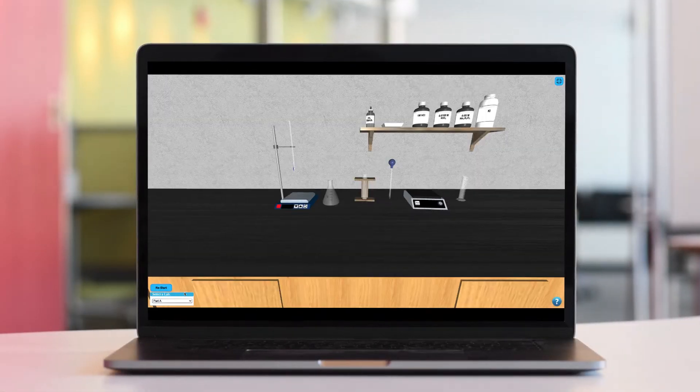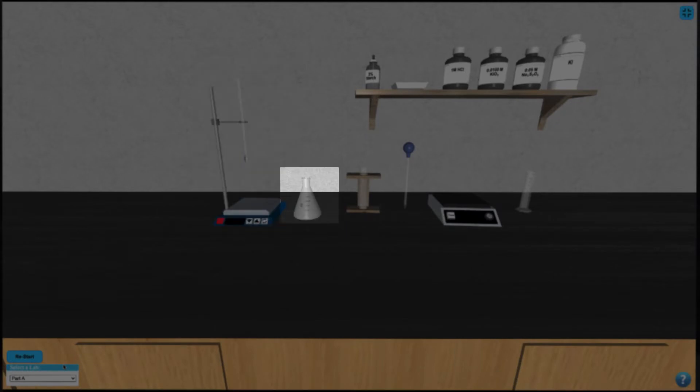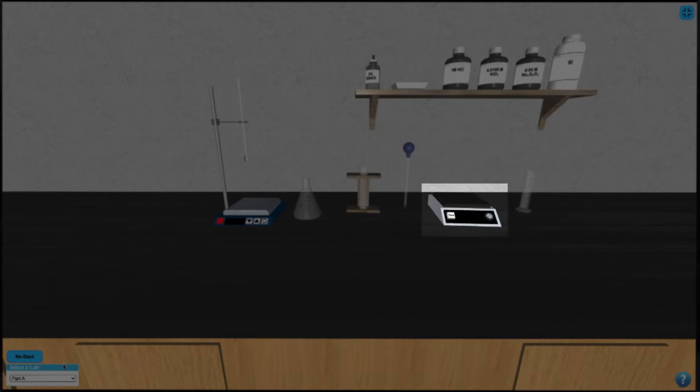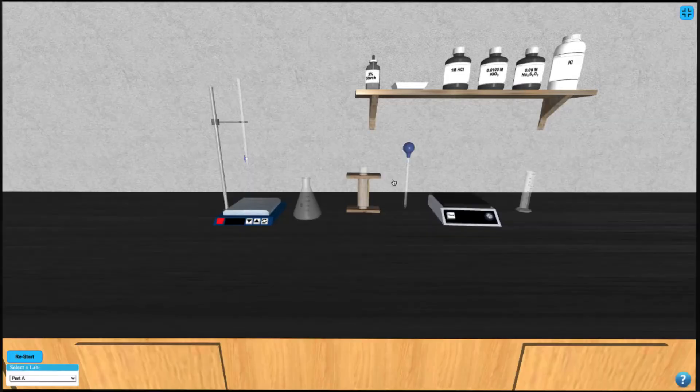In this simulation we have a burette over a stir plate, an Erlenmeyer flask, test tube, graduated pipette, balance, graduated cylinder, and a series of reagents to work with. In each part of this simulation the procedure is nearly identical.